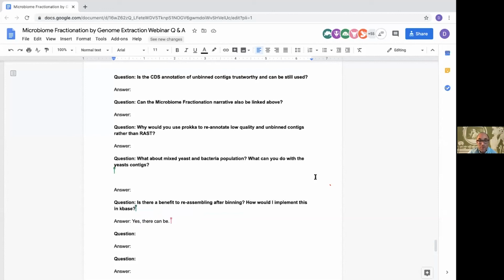Hopefully there will be some automation to take a binned contig, extract the reads that correspond to each bin, and then redo the assembly of that subfraction using an isolate assembler. Hopefully it will be easy to use, but still powerful.